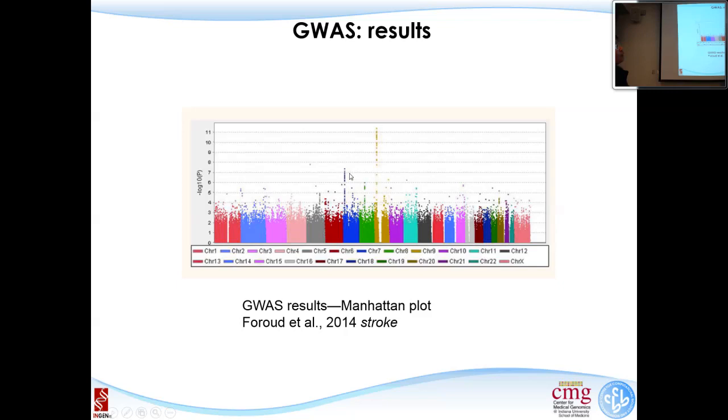For these two, chromosome 9 and chromosome 7, you can see a bunch of SNPs with similar, slightly lower p-values. We say they are in LD. All these results have LD support, so most likely they are real. For this one, it's just a lone star. You want to pay more attention and check the quality. If nothing is wrong, check whether it might be a low frequency missense mutation. Most of the time these are false positives. Occasionally there may be something real, like the ADH1B I showed you before.